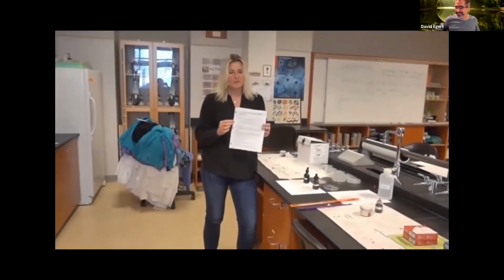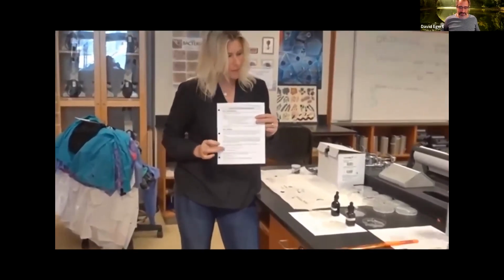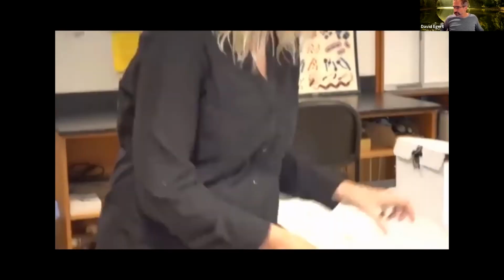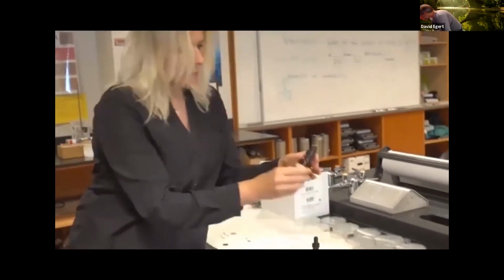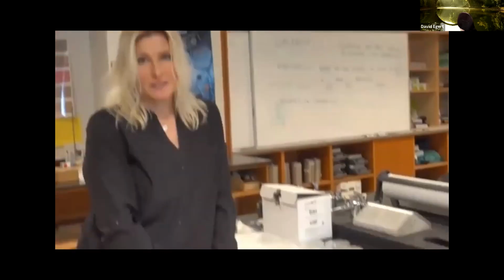All right, so here we're going to do the lab that is a demonstration of diffusion, and the experiment I'm setting up here is the one where we're going to put some of these dyes, methylene blue and potassium permanganate, into these wells of these agar plates.